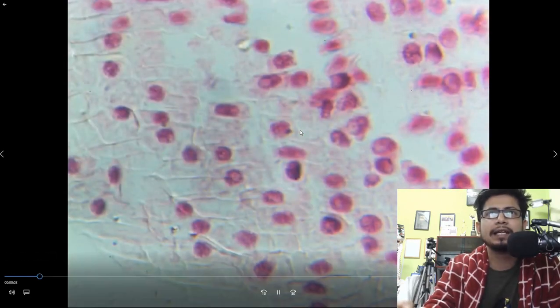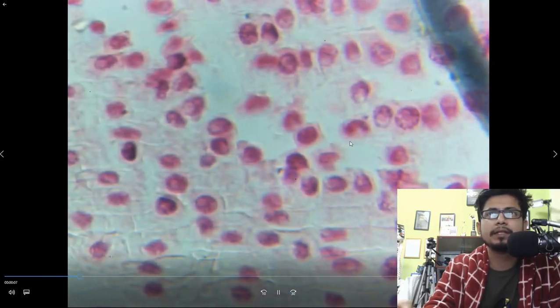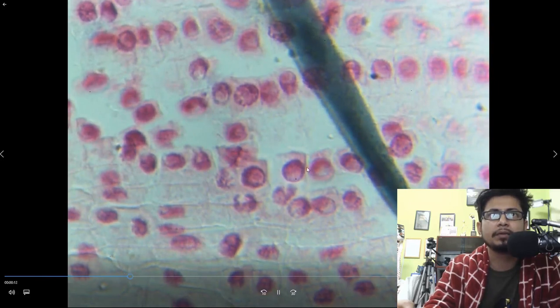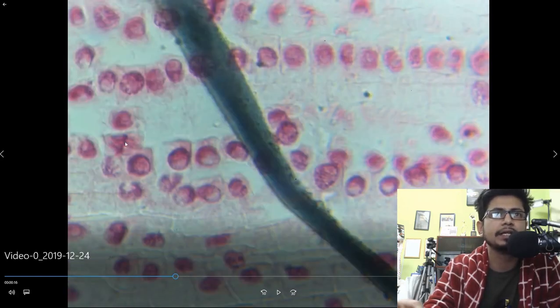You can clearly see all the different stages of mitosis. For example, here is cytokinesis — separating two nuclei together. This is metaphase; you can clearly see the chromosomes in the metaphase state. All the chromosomes are arranged here in the metaphase plate. This is the metaphase stage, and this is prophase.